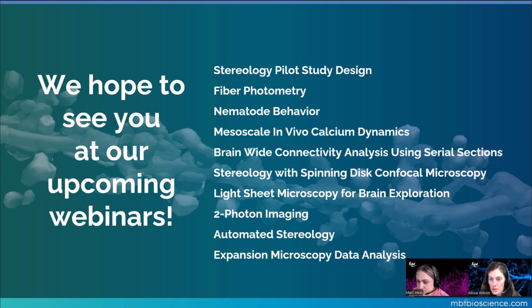And then we also have a couple questions about the largest file size that can be processed, and a couple about, again, the resolution of the data. So what is the minimum resolution needed? And PC requirements. So yeah, putting those together to answer.